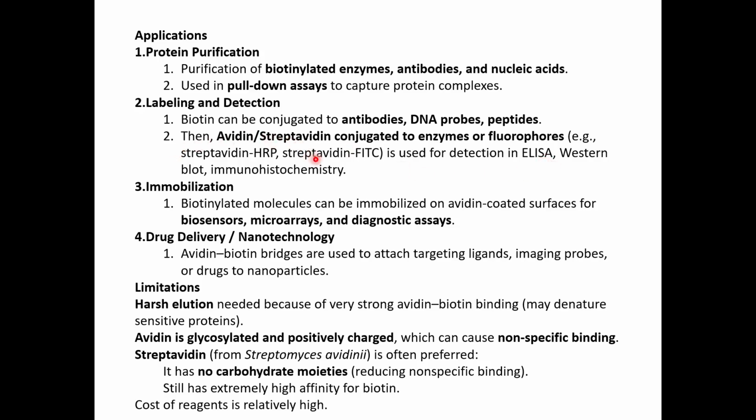So this biotin avidin is a very famous, popular pair, which is used in many techniques like your Western immunoblotting, your ELISA, your IHCs, in your immunohistochemistries, your DAB staining, or immunofluorescence, etc. So this is very useful in many of the techniques.